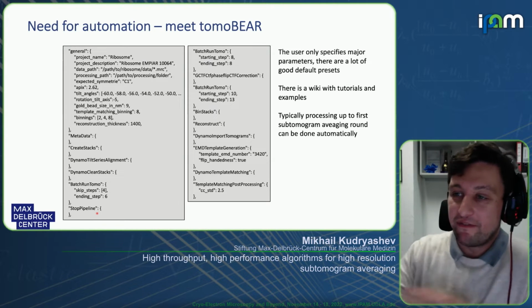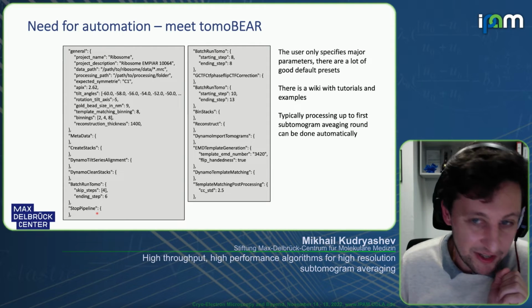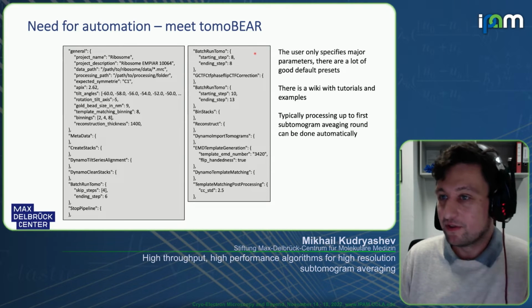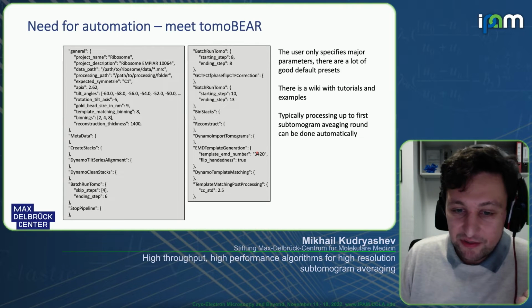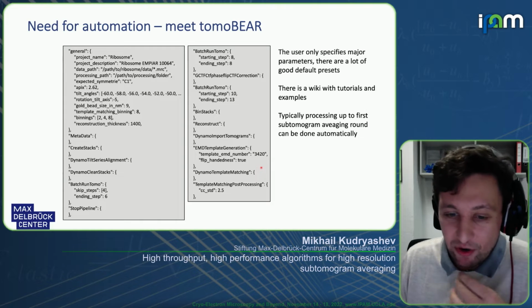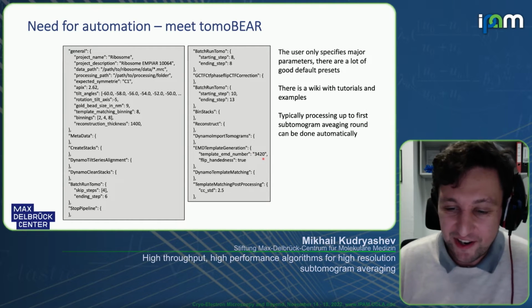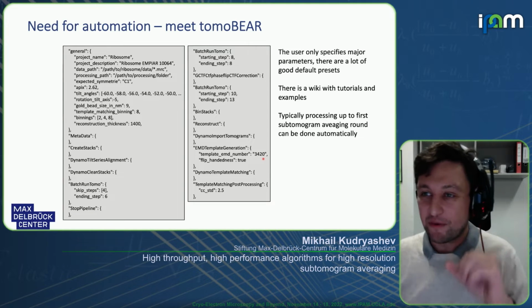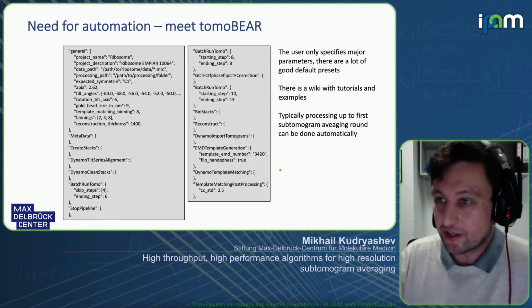So for example, fixing alignment parameters is easy to do in IMOD. Once that's done, tomograms can be CTF corrected and reconstructed without human intervention. We also made a template matching, put it on GPU. It's inspired by Dynamo. We allow users to get an EMD deposition, just pull it and then convert it to the proper pixel size and all, run template matching and extract the particles.